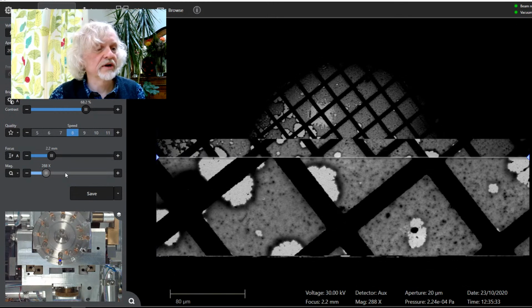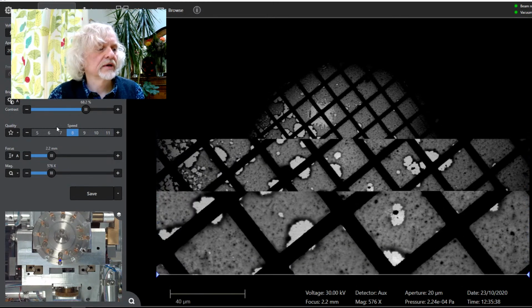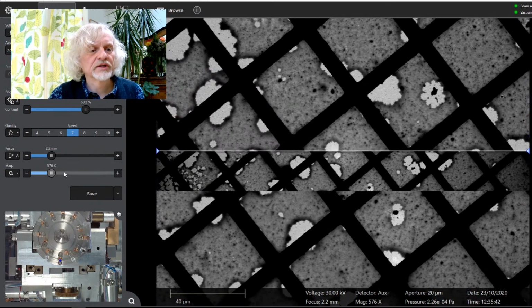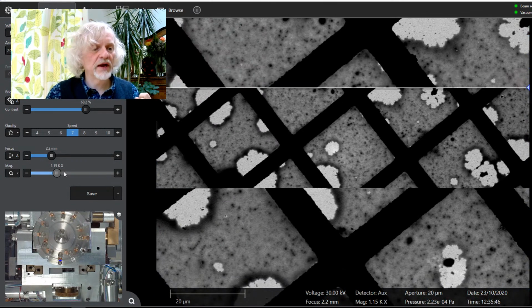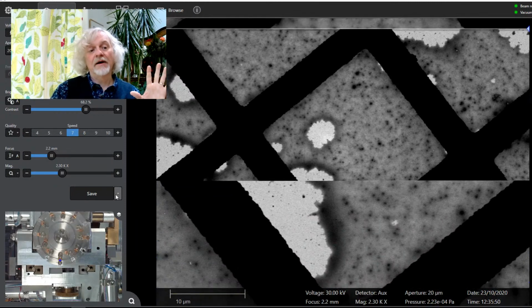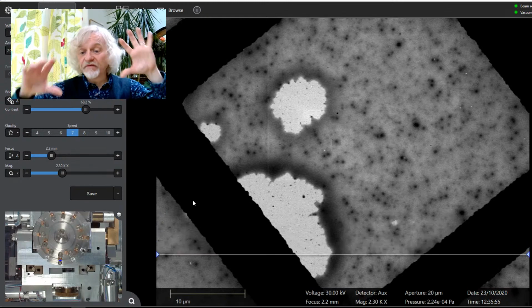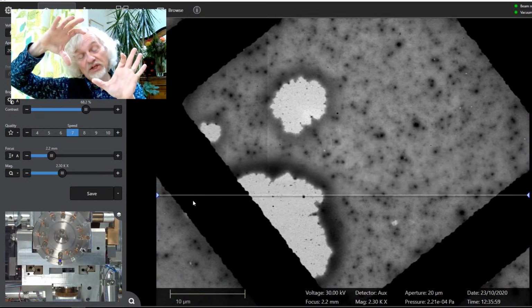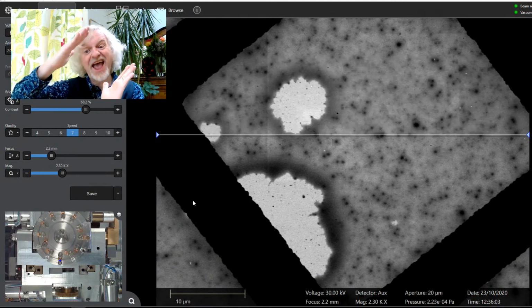Oh, I zoomed out. Sorry, my mistake. We'll zoom in again, and let's have a look. I'm going to speed it up just a squeak like that so that we can go a little bit faster. I'm going to keep going in, and I'm just keeping an eye on the zoom bar at the bottom, and I'm going to pause here because at this scale, we're now at the point where one of those tiny little grids is filling the entire screen. One of those tiny little grids is about 1/3 of a hair.